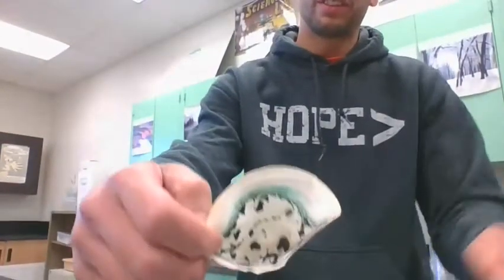Okay, so just to wrap up our lab here, where we made the copper hydroxide. This filter paper was really wet, so I had to put it in the little oven we have in the room that heats up so that the water boils off. And the end result is a lot different than what it looked like before, right?